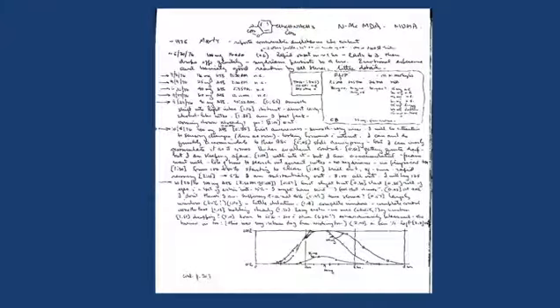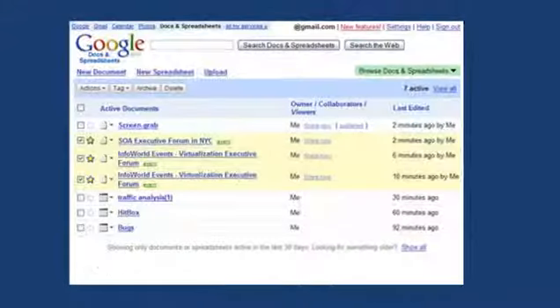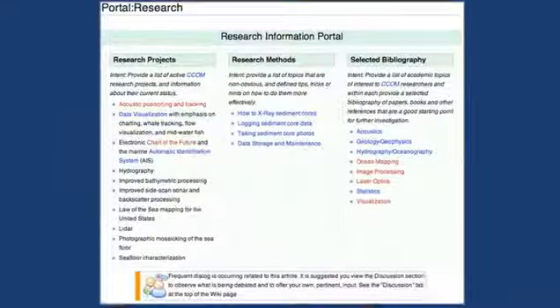You may have tried other means of moving from paper to electronic recording of data, like Google Docs and wikis. They're both useful because they're online and so accessible 24/7 by everyone in the group, and provide a convenient framework for sharing general information like meeting notes and protocols. eCAT does that too, but it does much, much more.